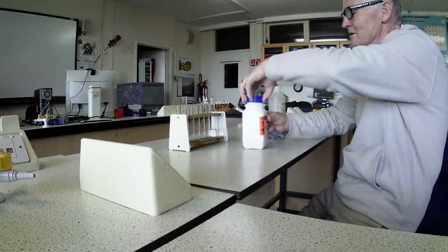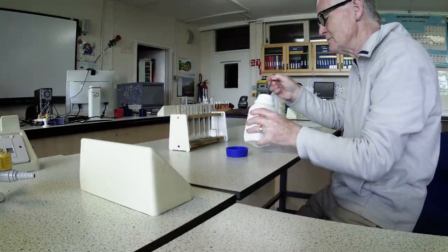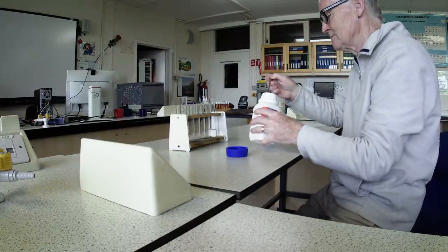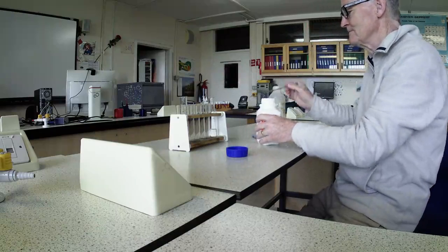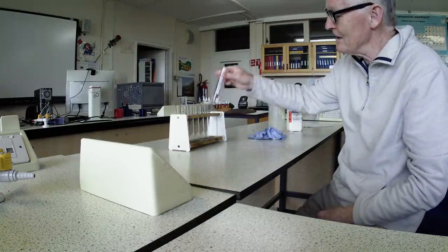So here's calcium nitrate. And we will get that to dissolve.